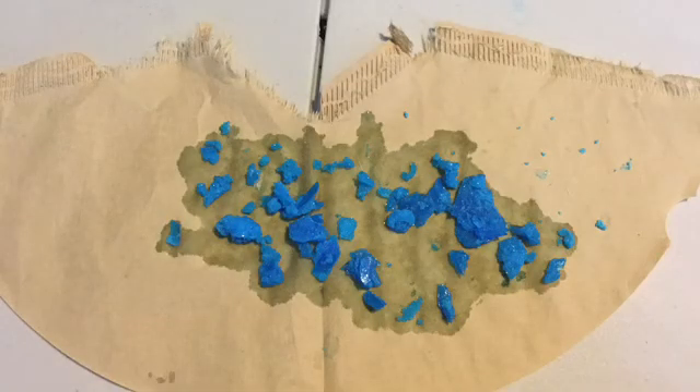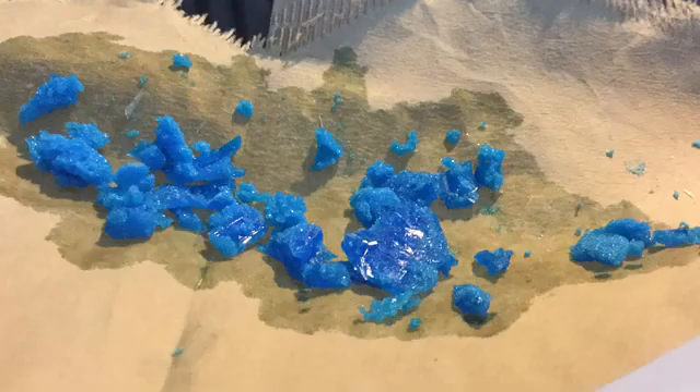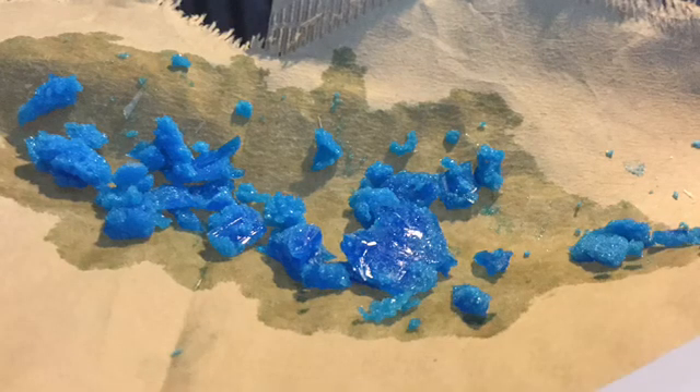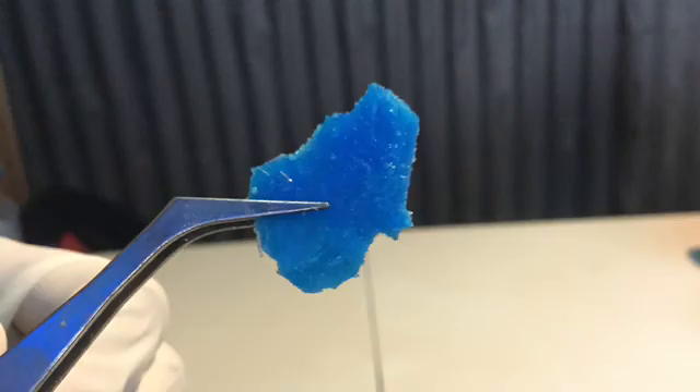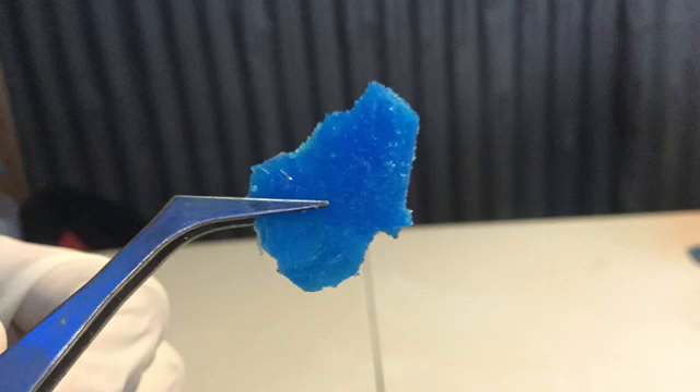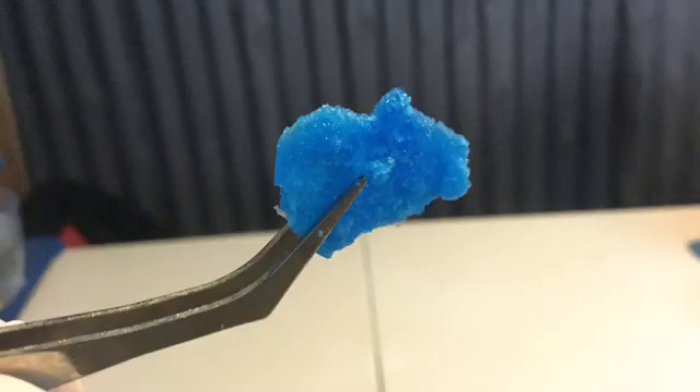Here you can see the final copper sulphate crystals. They have maintained their nice dark blue colour. This is a closer look at the copper sulphate crystals — they have a nice twinkling appearance. An individual crystal was held closer to the camera. From this view, you can see the rigid yet aesthetic texture of the crystal.